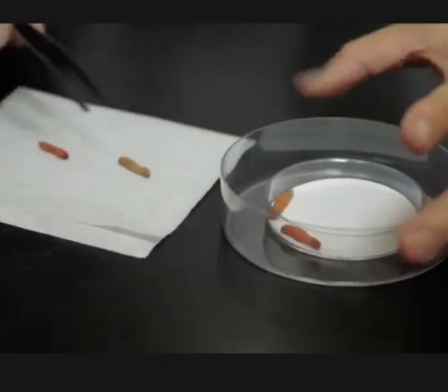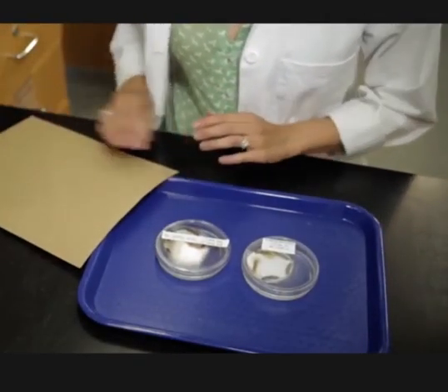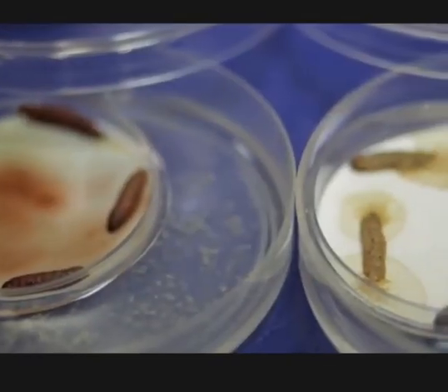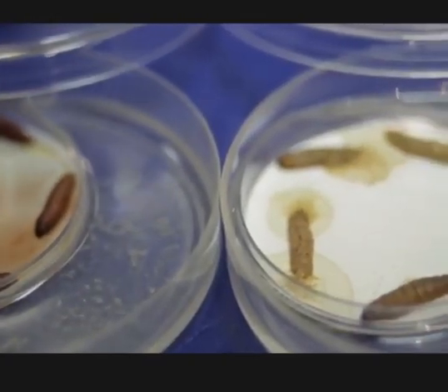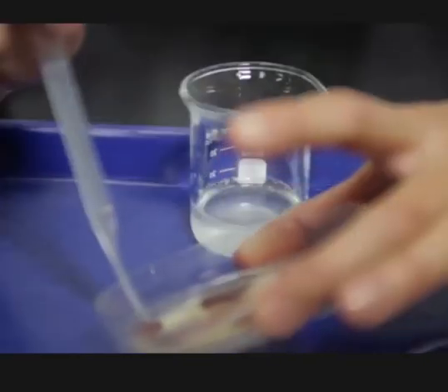Nematodes were isolated from the dead insect bait by placing the dead insects in a moist and dark environment and allowing the nematodes to migrate out into the surrounding water. The nematodes were then collected from the water and analyzed.